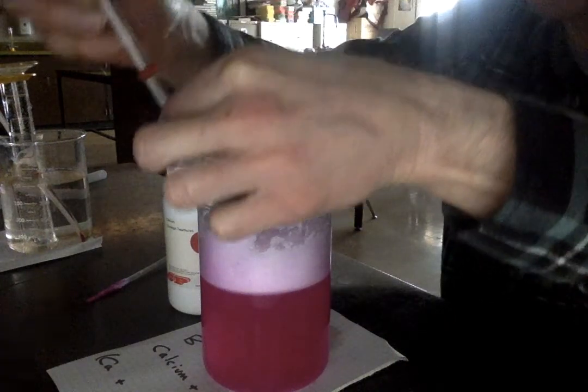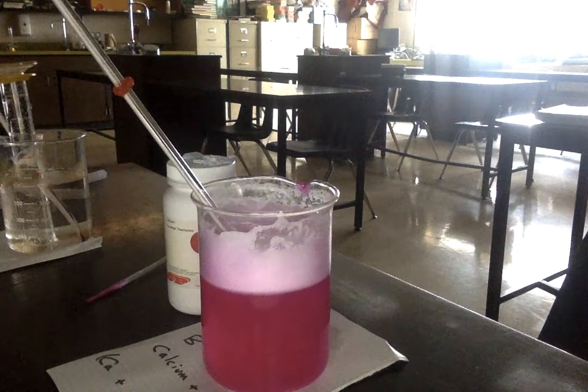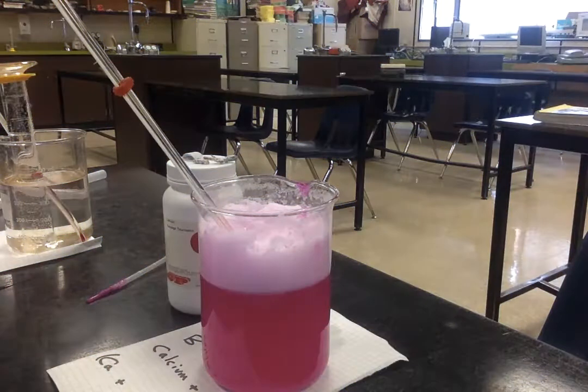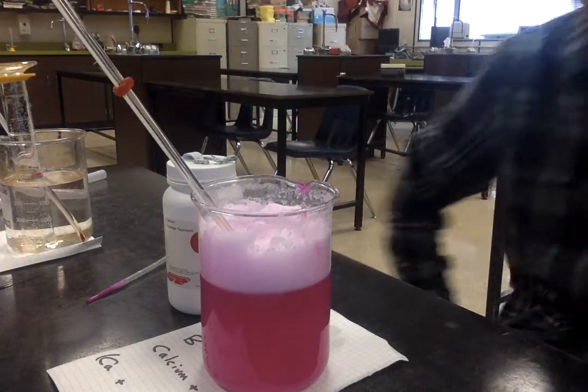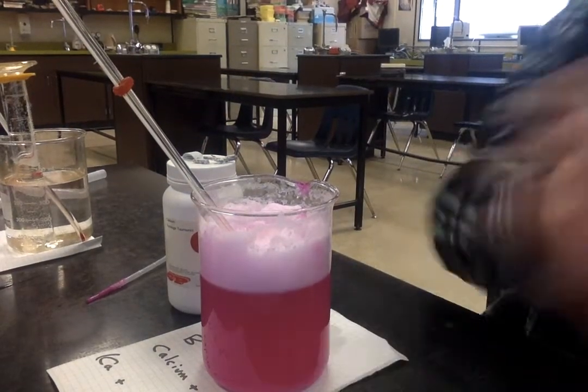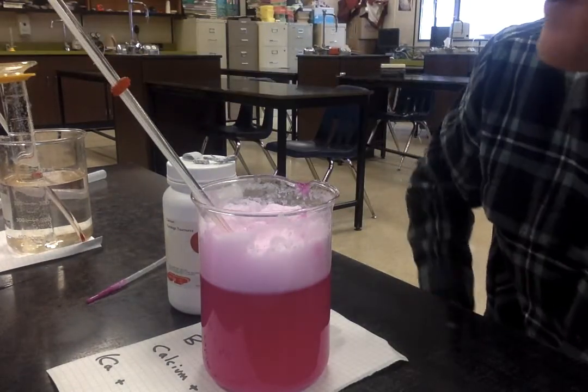Let's measure the temperature again. I'm going to switch the light on, switch off the Bunsen burner. The temperature in the solution is now 23.5 degrees.